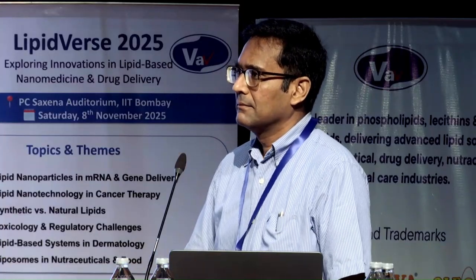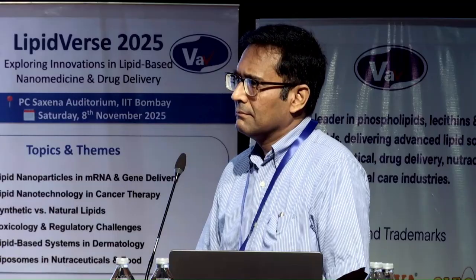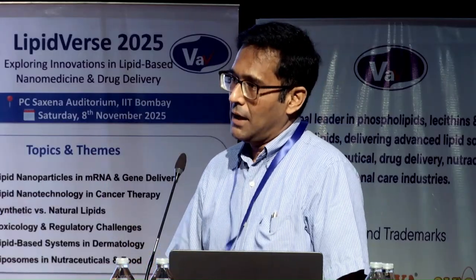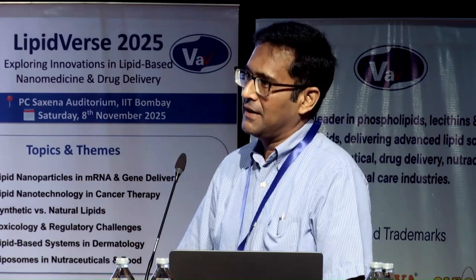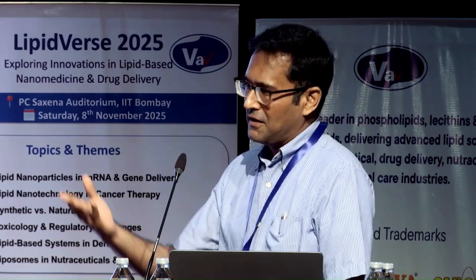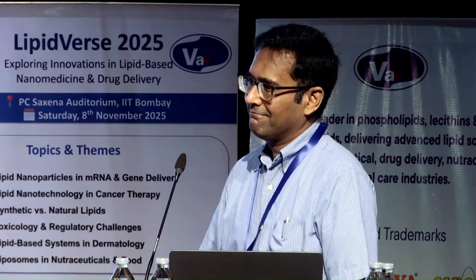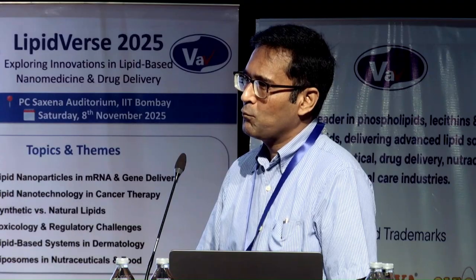Would you be able to eliminate the risk of alumina by adding a centrifuge step post the LNP, which should be a very, very simple step? Very good idea. Yes, I think that should be possible. Once we have collected them, just do the centrifuge. Absolutely, very nice idea. It could be done in batch mode or continuous mode. It's a very tiny thing. At 300 nanometer, because the densities of alumina are extremely high compared to anything else in the system. Exactly.